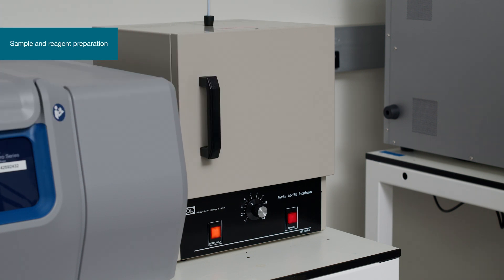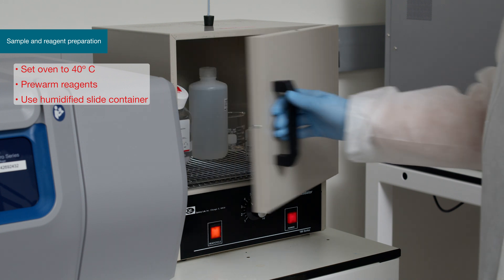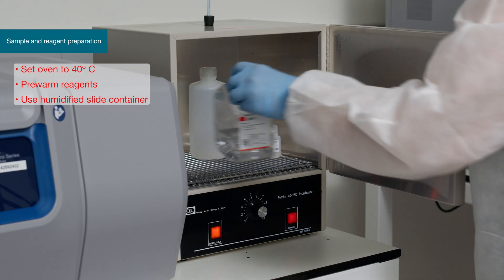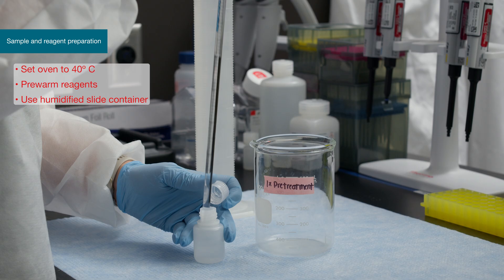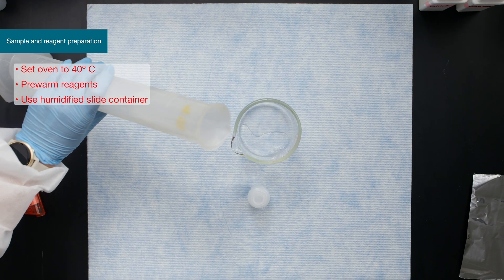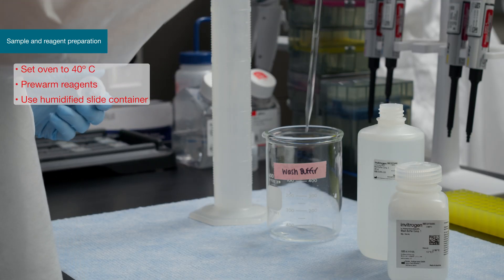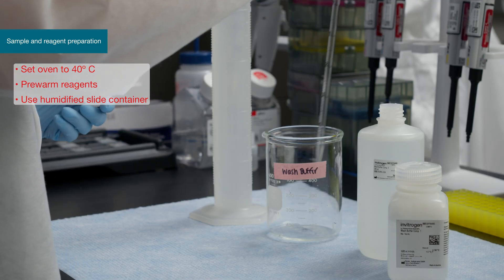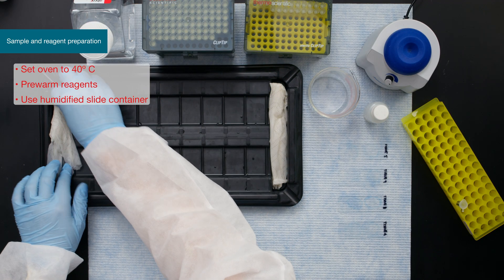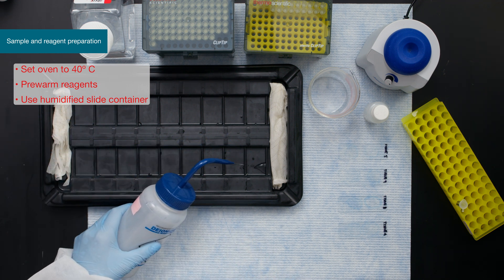The reagents and equipment should be prepared before beginning the protocol. Calibrate the dry oven and ensure it is set to 40 degrees Celsius. Temperature and incubation times are critical to success and should be followed closely. Reagents should be prepared and pre-warmed before beginning the experiment, including 1X PBS, fixative, 1X pre-treatment solution, wash buffer, and storage buffer if using an overnight stopping point. Then prepare the slide moisture chamber by wetting paper towels with distilled water, warming to 40 degrees Celsius, and layering into the slide staining tray.